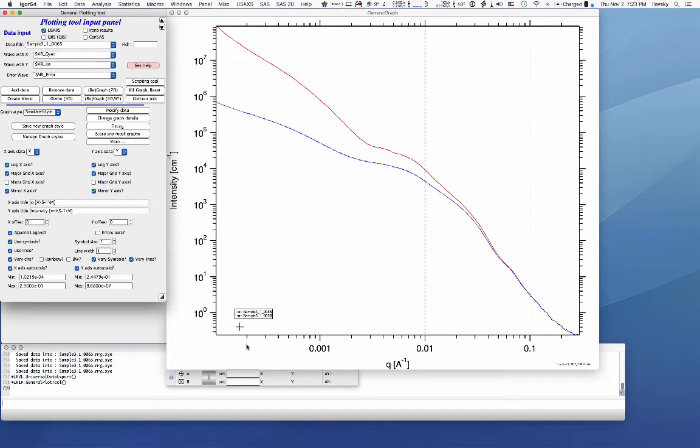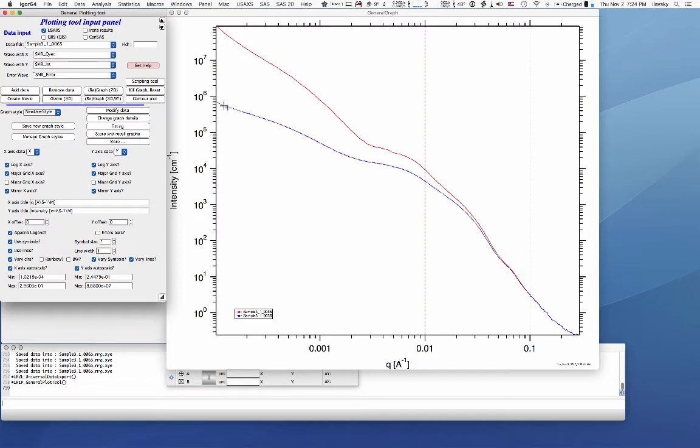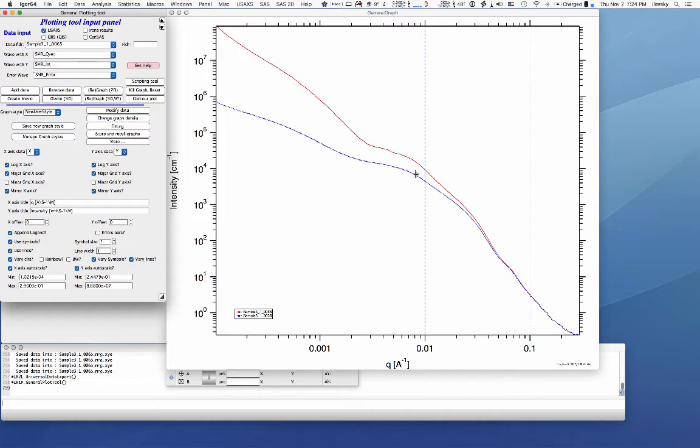So these are data we collected originally. We ran them through a routine which de-smeared them and so these are pinhole equivalent. Here you can do a standard Guinier analysis of this knee. Here you cannot. Here you actually have to have the slit smearing built in the routine model.